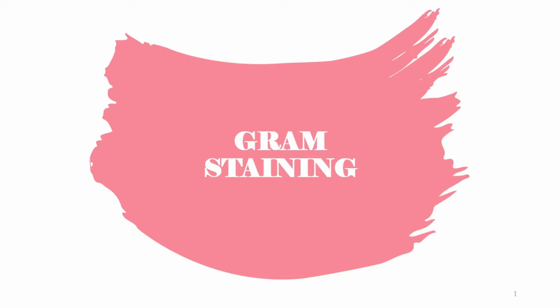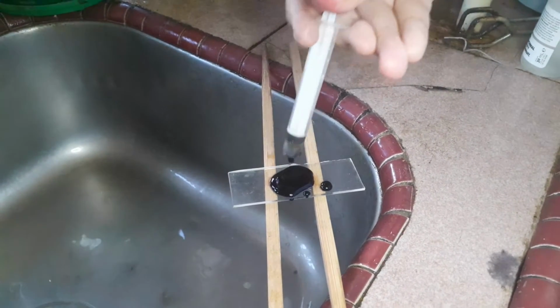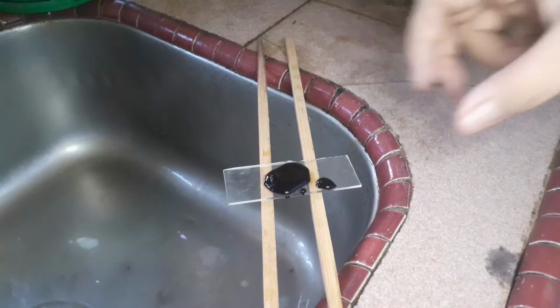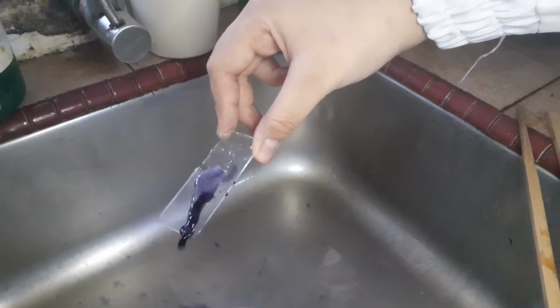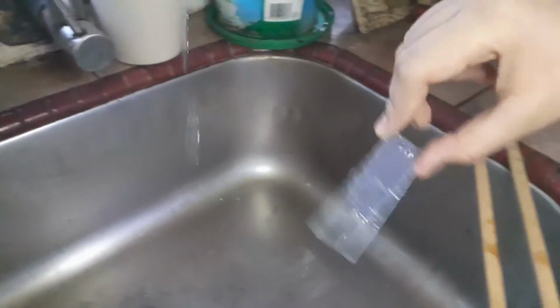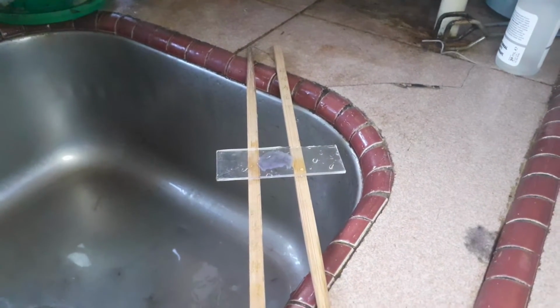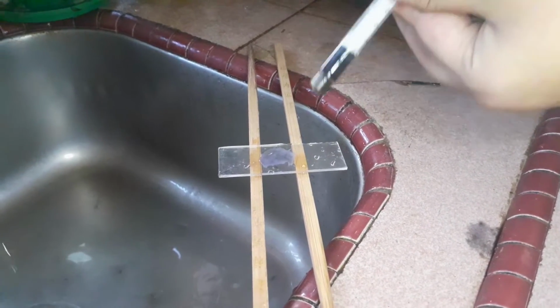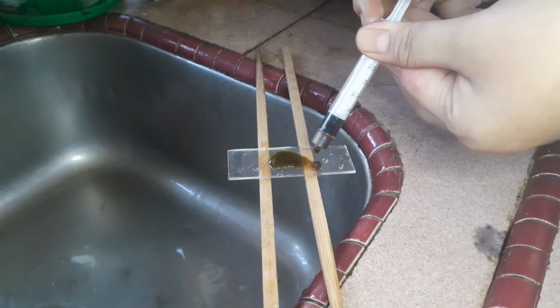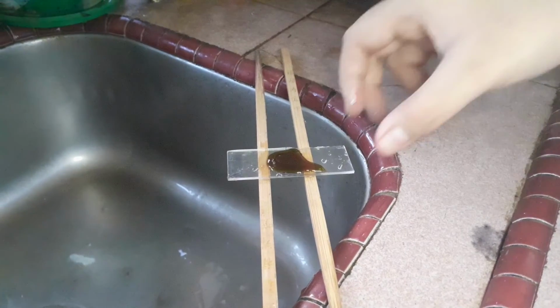Next is the gram staining process. Place the slide on a staining rack. Gently flood the smear with crystal violet and let it stand for 1 minute. Then, wash with tap water. Gently flood the smear with gram's iodine mordant and let it stand for another 1 minute. After 1 minute, wash with tap water.